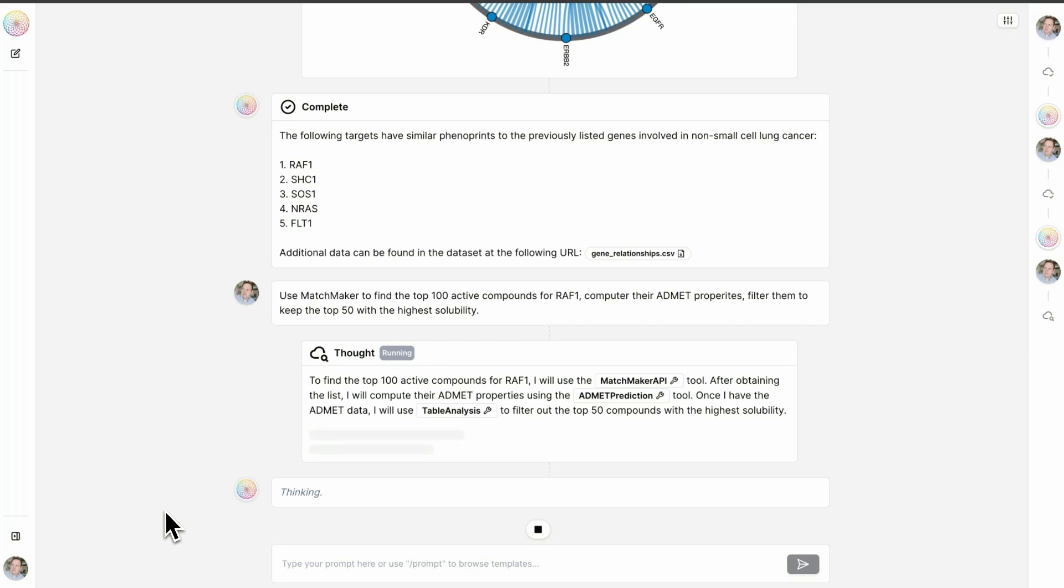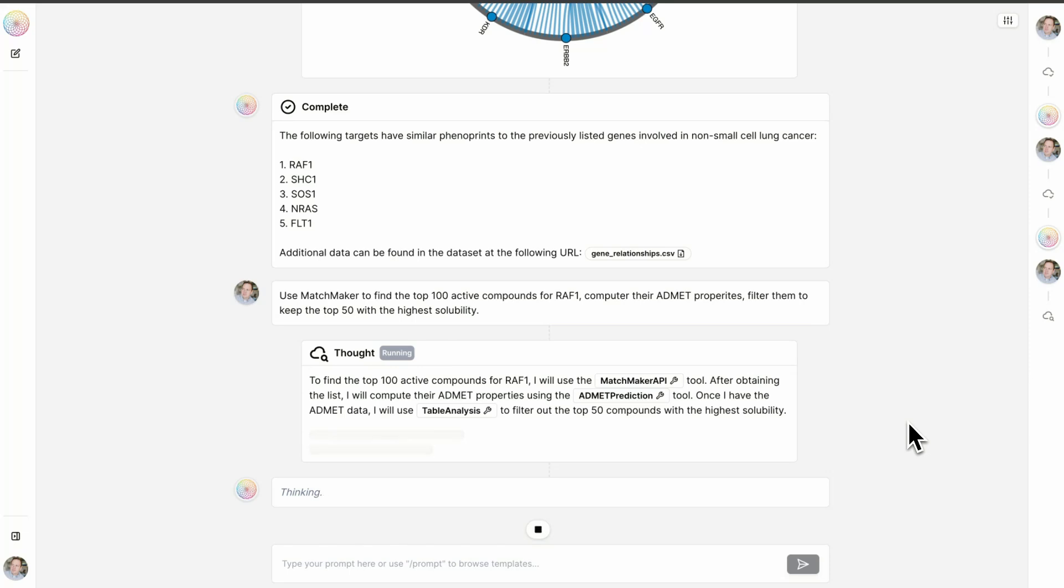You can see here that the output will be a 3D scatter plot showing the fingerprint embeddings of each compound. And you can also see that we've predicted the ADMET properties for each compound as well. This is a very large data table for it to sort through, so we'll give it just a minute while it continues to think.